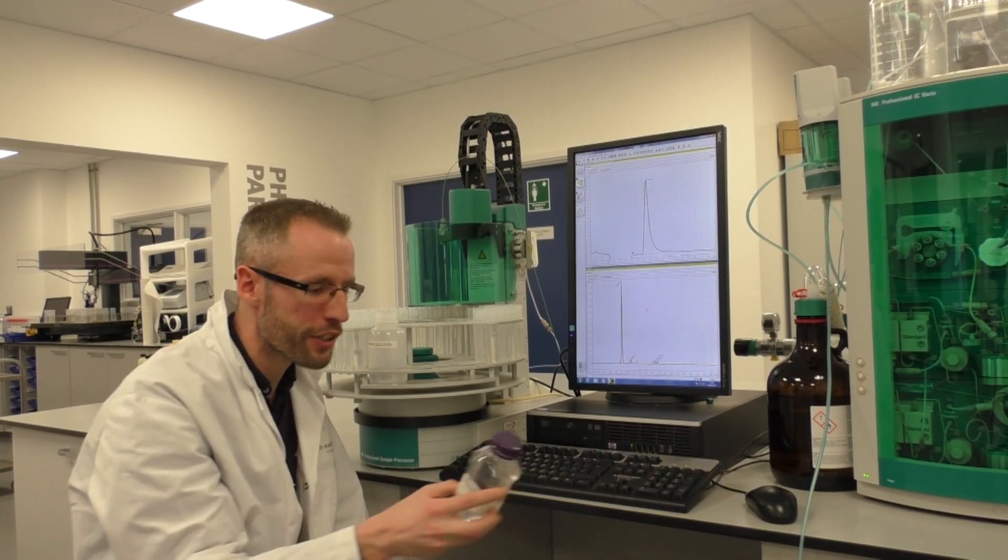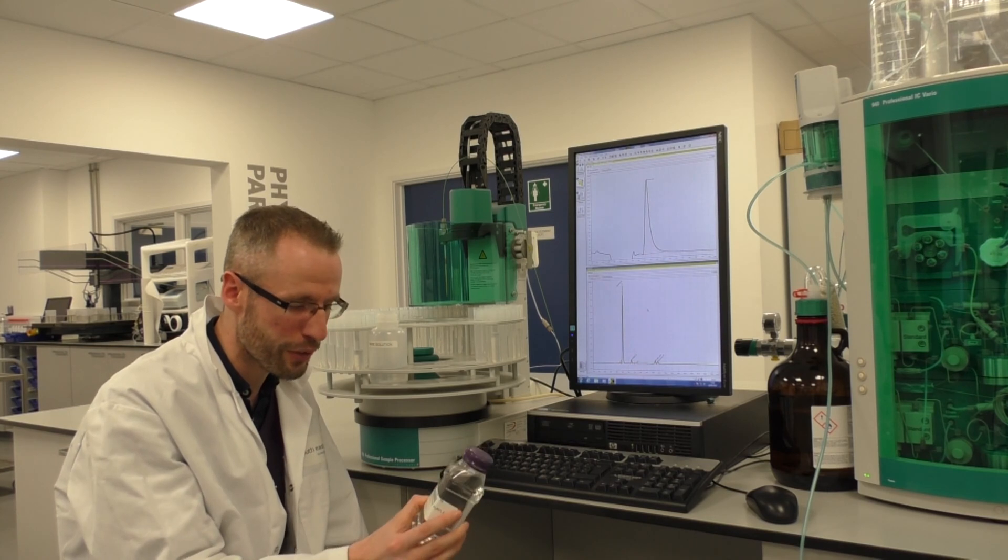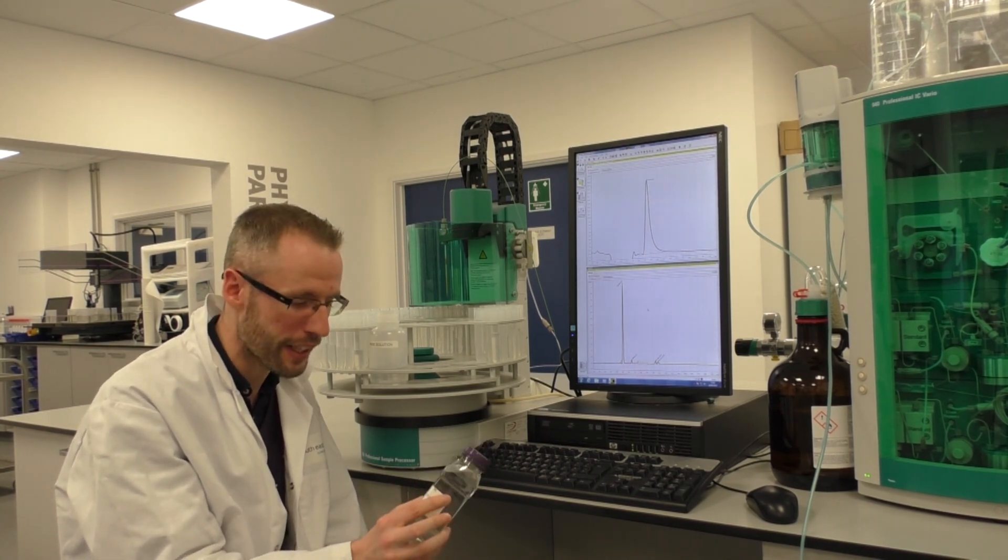We run a measure for a range of samples including potable waters, surface waters, and ground waters. This one being from a treatment works which will be analyzed for bromate and chlorite.